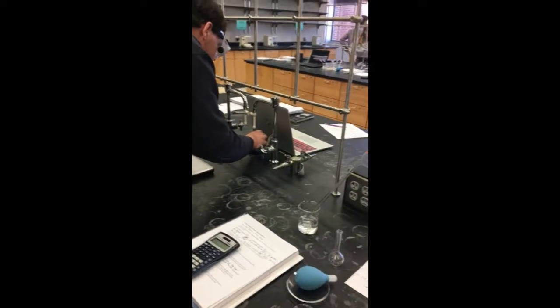We recorded the absorbance values and found the final concentration values, which should all be observed here.